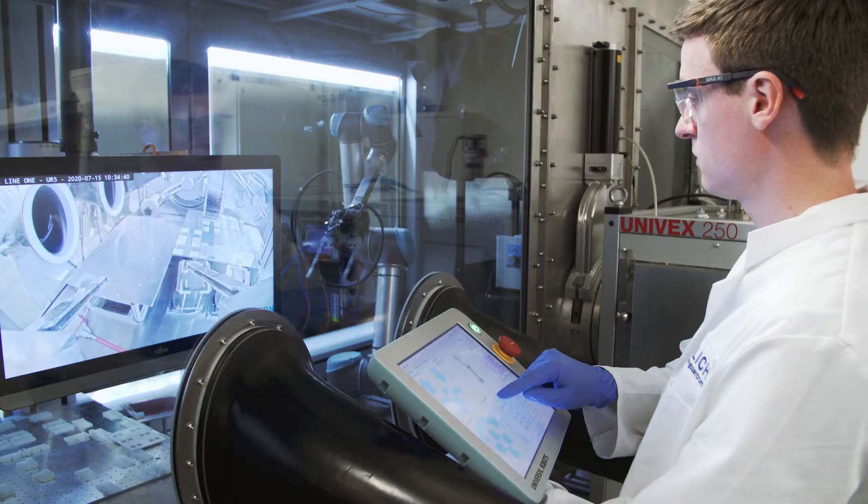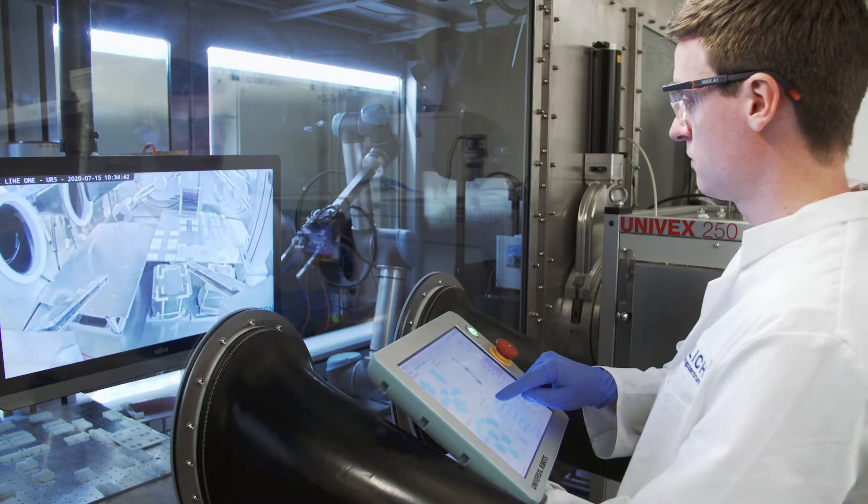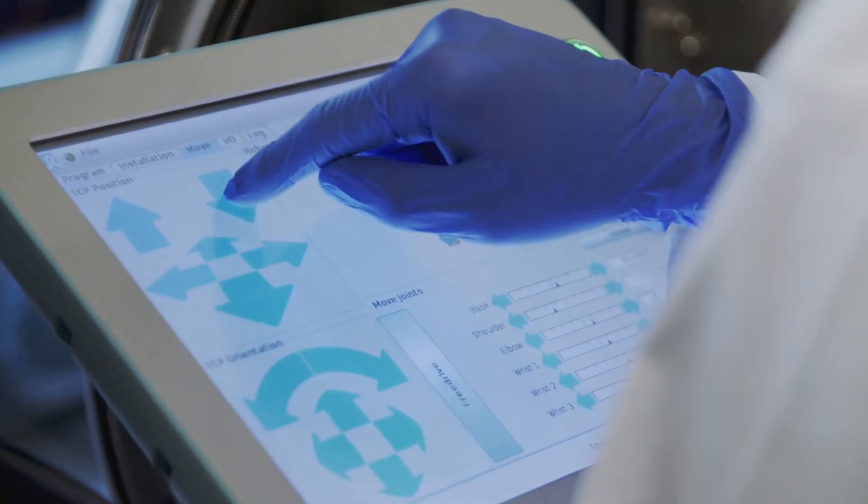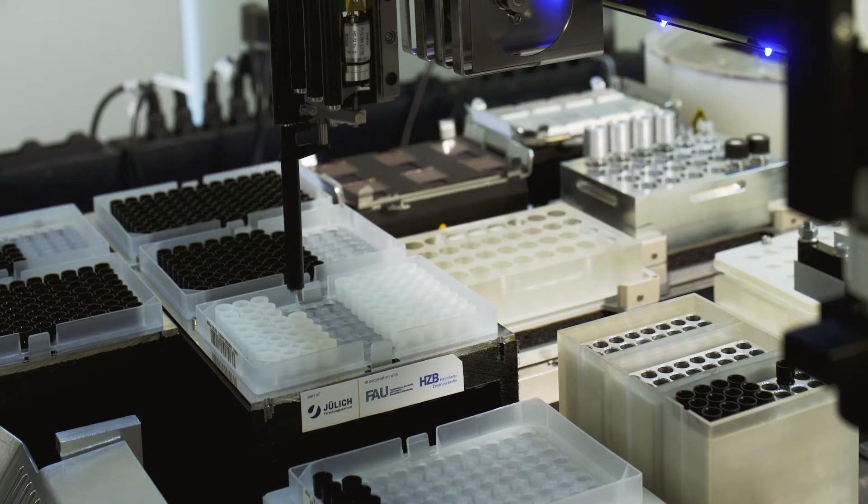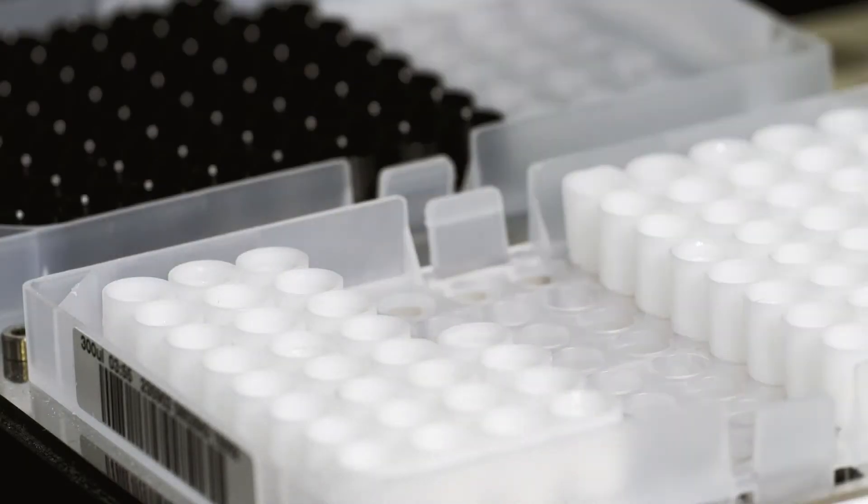The automation of laboratory experiments is challenging. On the one hand, you need to limit the tasks the system can perform in order to automate them. On the other hand, we want to retain as much flexibility as possible. The big advantage of our system is its precision. The robot can perform even complex tasks exactly the same every time.